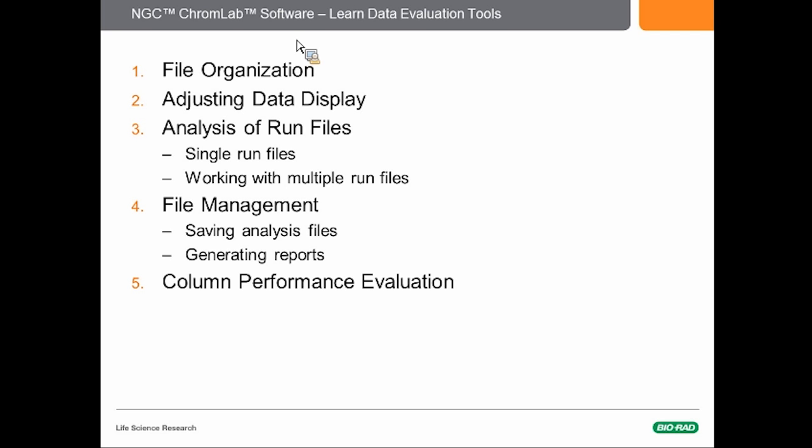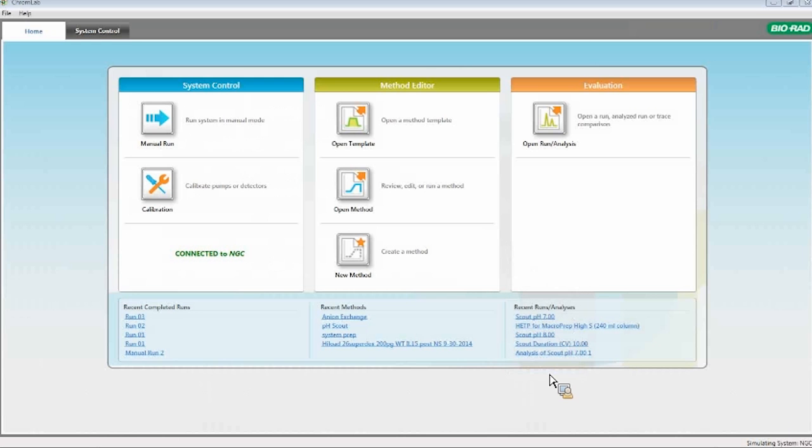Okay, so now let's switch our view to the home screen of the ChromLab software. For today's presentation, we are going to focus on the evaluation section over here of the software, which is used for post-run data analysis. This presentation will not cover the system control or method editor sections of the software. However, if you have any questions on these sections, please feel free to contact us at Bio-Rad Technical Support. I'll display the contact information at the end of this presentation.